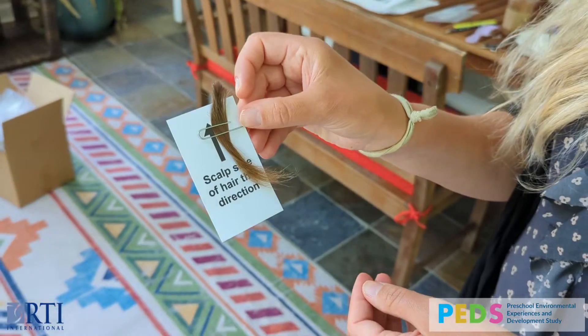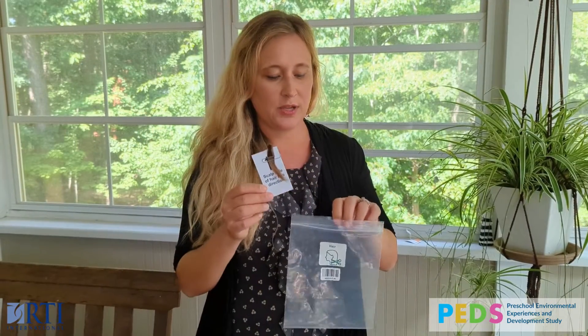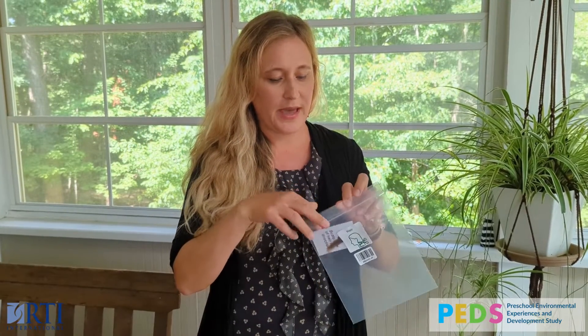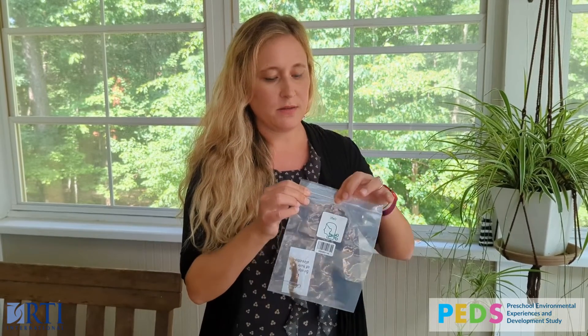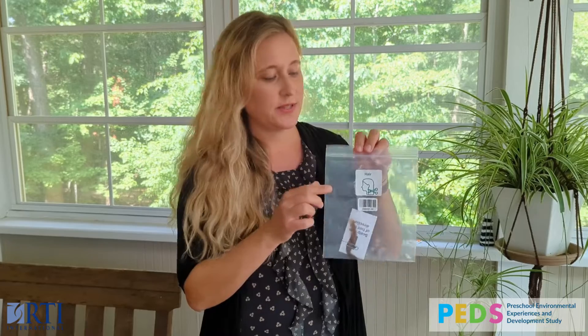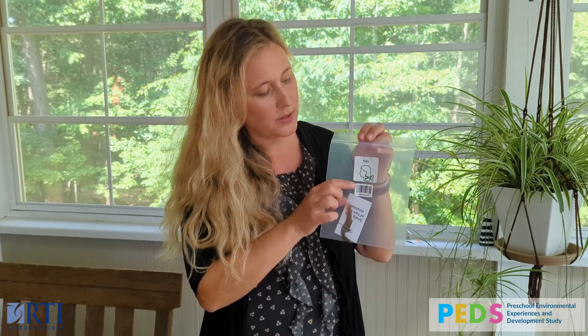Once the hair is trimmed and placed on the card with the scalp facing up, carefully place it back in the bag, making sure no hair is sticking out, and seal it well. The bag you should place it in has the hair icon and a barcode label.